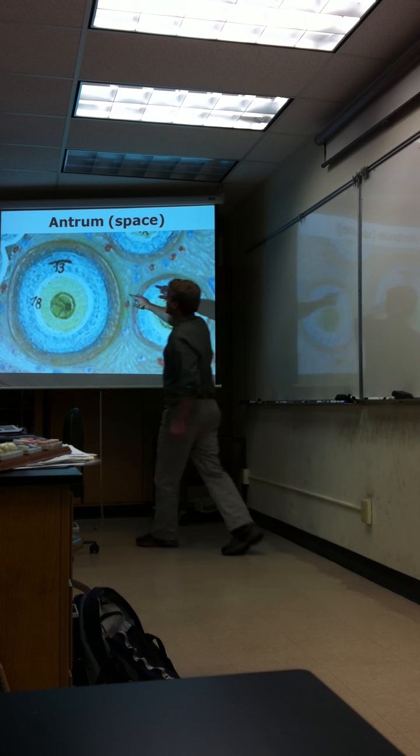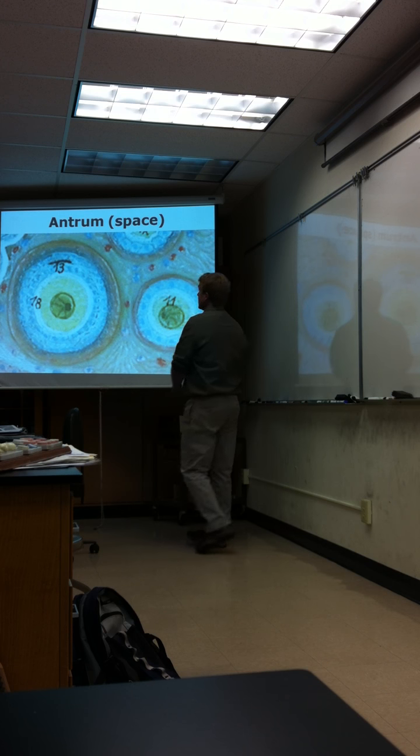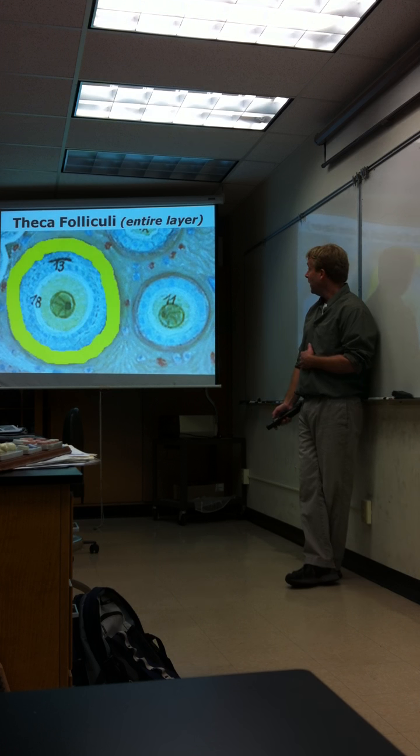Assuming that this is an antrum, this is a secondary follicle, because as long as there's an antrum, it'll be a secondary follicle. But you can see why I don't particularly like that secondary follicle. It doesn't show a good antrum. But that's why that is a secondary follicle.